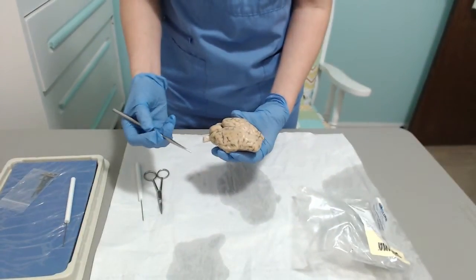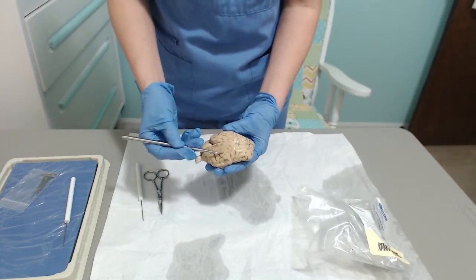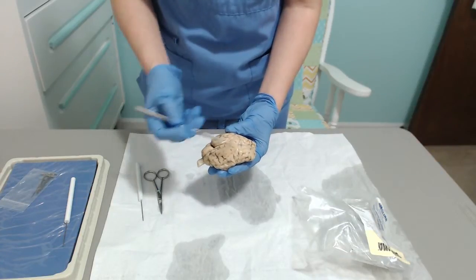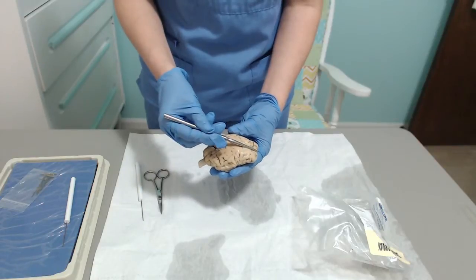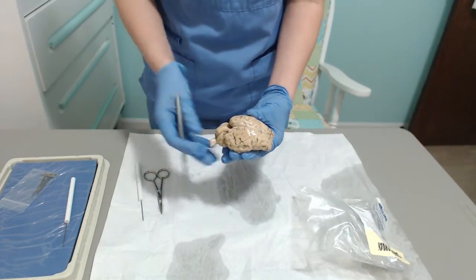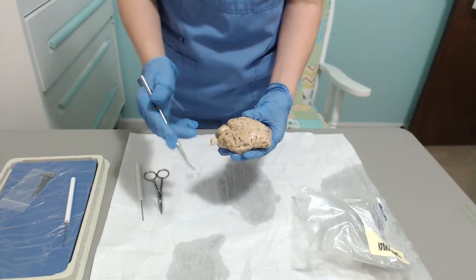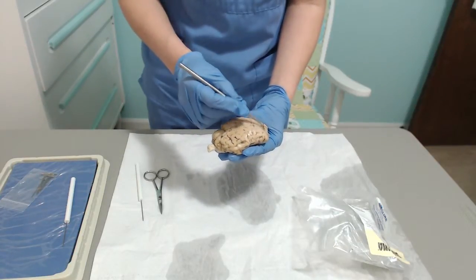Okay, so I'm going to begin with the right and left hemisphere. So here is the right hemisphere of the brain, and then the left hemisphere, the frontal lobe, and also the anterior, and here's the posterior section. In the sheep brain, it's a little bit different just because of the anatomy of the sheep. It's more lateral. Okay, so the frontal lobe again is right here.